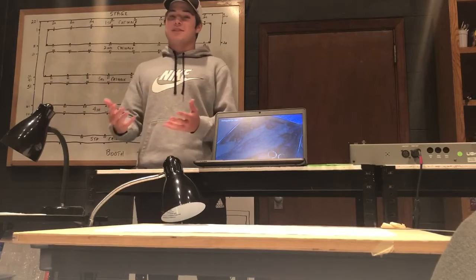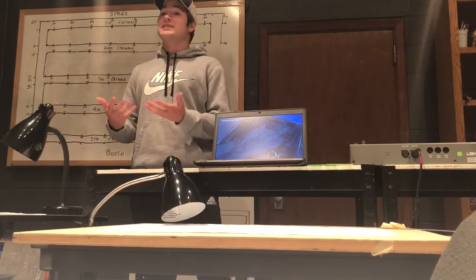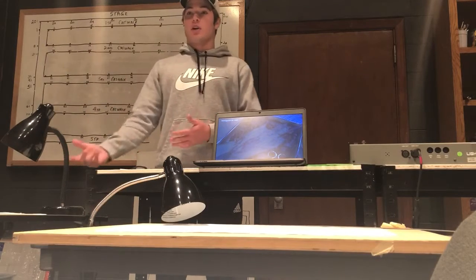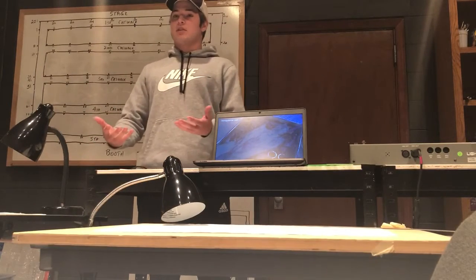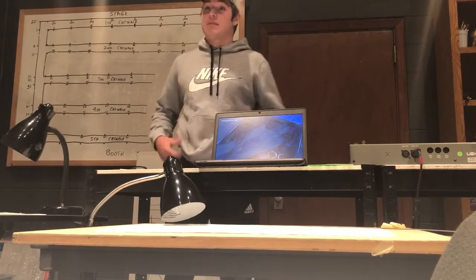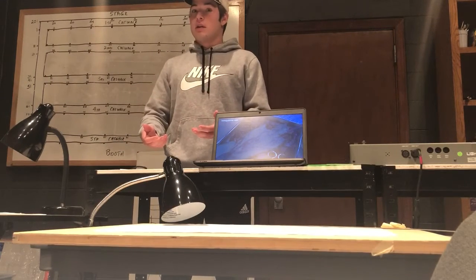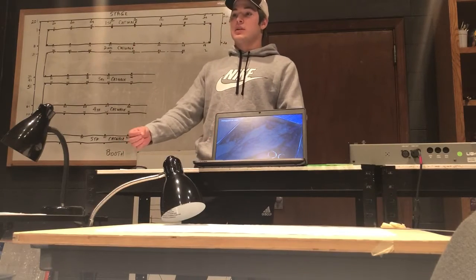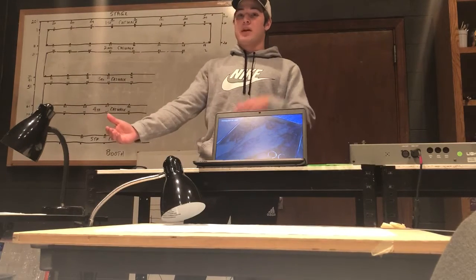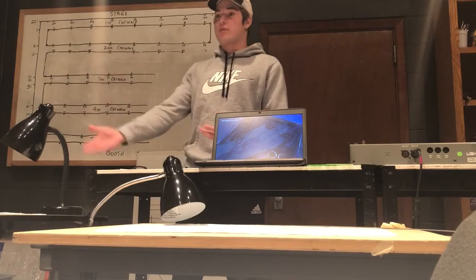Alright, once you open it, your professor would probably have different things for you to do once you are inside your specimen. He might have you look for the heart, lungs, liver, gallbladder, different things that are inside of the squid. He might also have you do other things. In my class we would cut off one of the arms, measure it, and compare it to another squid to tell if it was a male or a female. It does have male and female reproductive parts, but they're very hard to see, so there are other characteristics you would go through to see whether you have a male or a female.